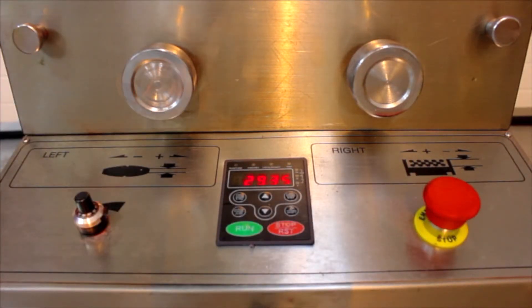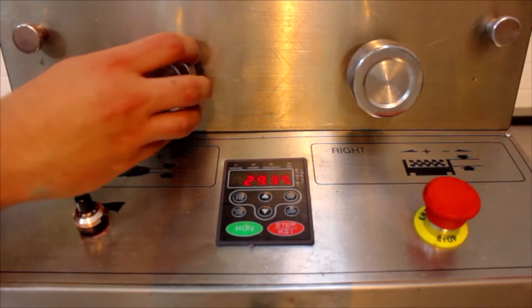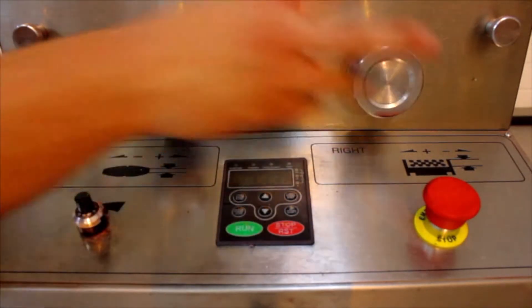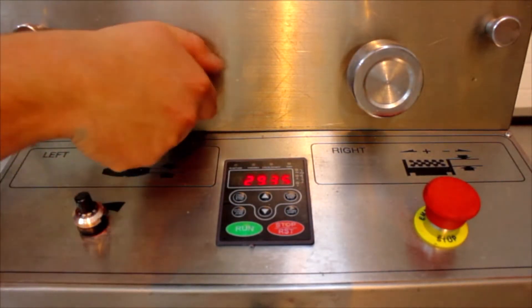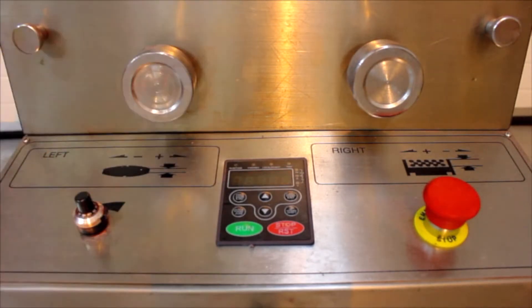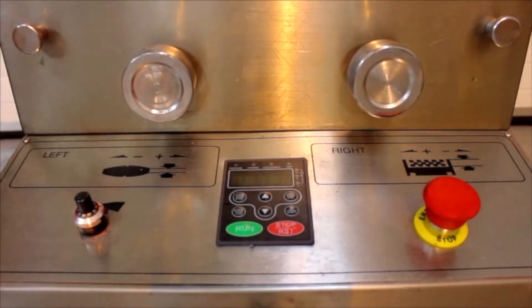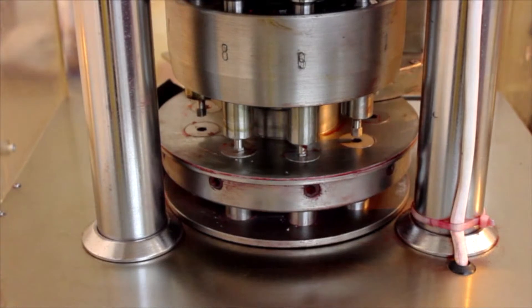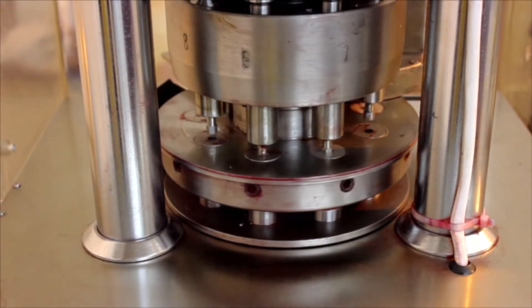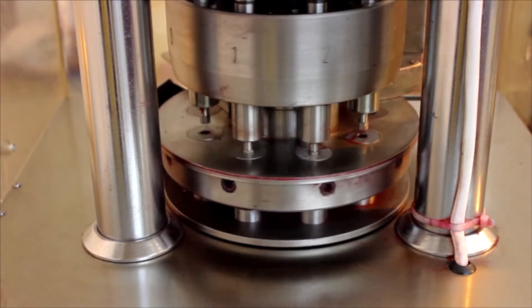The punch pressure and the fill depth on the RTP 9 are controlled through two knobs on the front section. Simple adjustment of these is achievable, making it a very user friendly machine. Here you can see the RTP 9 being adjusted from minimum speed up to maximum speed.